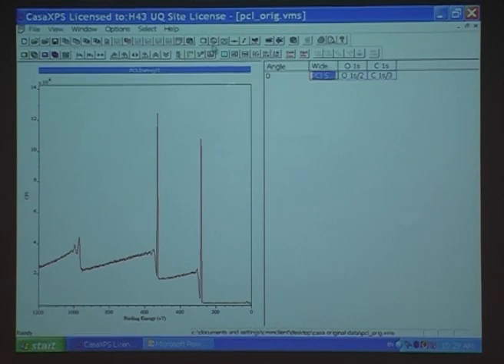You've got icons up here for copying and pasting. The main ones we use are this little group here for processing. This is for printing and help. Down here is more display things: zoom in, zoom out, go up, go down and change scales, all sorts of things. I mostly use zoom in and zoom out and this little group. So even though the software can do a whole range of things, 99.9% of the time you're using about four or five functions.